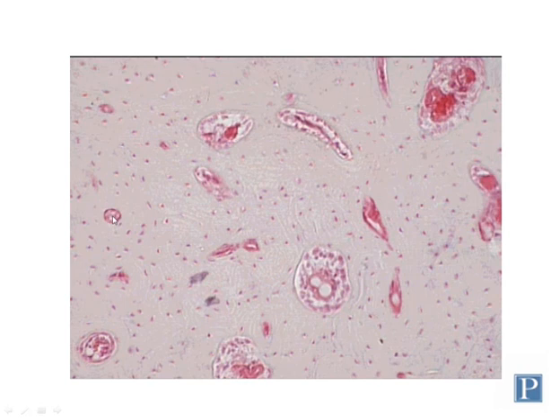The central canal or haversian canal is the center part of a larger structure which is called an osteon, and an osteon consists of several rings of what are called concentric lamellae that are arranged together. These ring-like arrangements of the bony matrix are really hard to see with a decalcified bone preparation, and it's easier to see the overall structure of the osteon later on when we look at ground bone preparations.